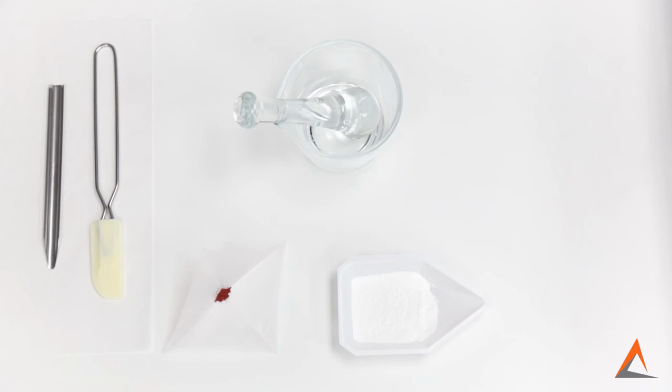quantities together to achieve a homogeneous mixture. In front of me, I have a really small quantity of red dye and a much larger quantity of white powder, which in our case is lactose. We'll now use geometric dilution to combine these two powders in order to obtain a homogeneous mixture.